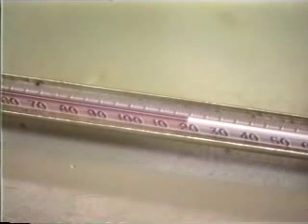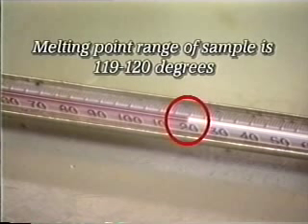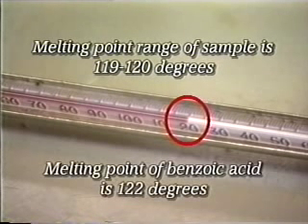The melting point of the sample is 119 to 120 degrees. The melting point of benzoic acid is listed as 122 degrees in the CRC. The narrow melting range and near proximity to the literature value indicates that our demonstrator has successfully purified benzoic acid.